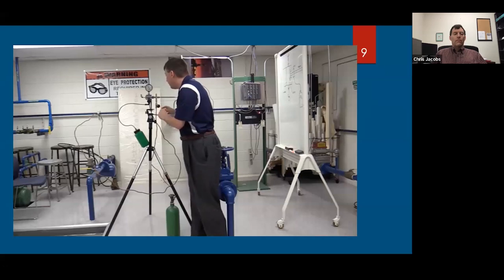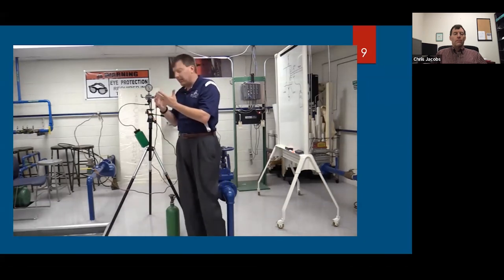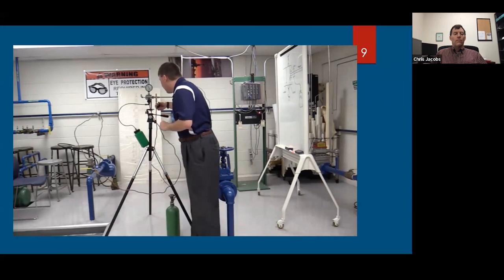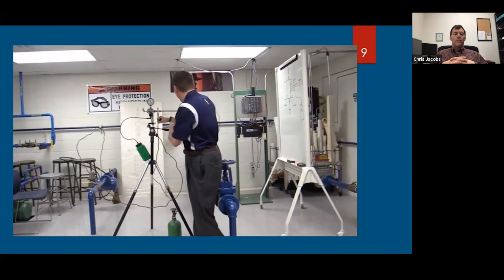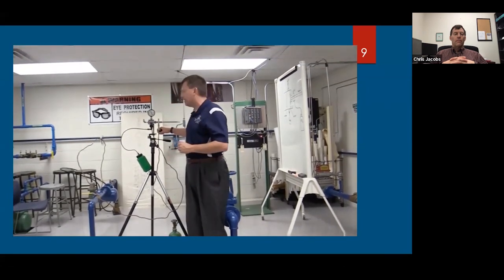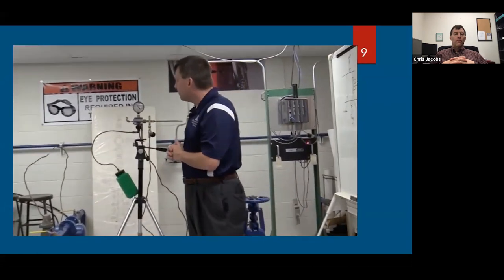So I'm just about finished here. Okay, the last drop came off, and now my temperature is at 62 degrees. So we're averaging a dew point here around 60, 61 degrees. Let's do one more shot and see what we get. Okay, I'm just starting to see condensation again. The temperature is now 61 degrees. I'll wait for it to evaporate off of the internal mirror, and we will look at it again.